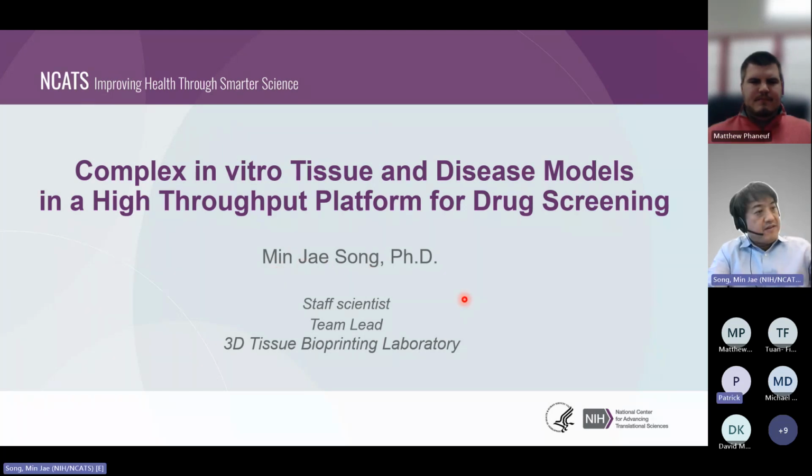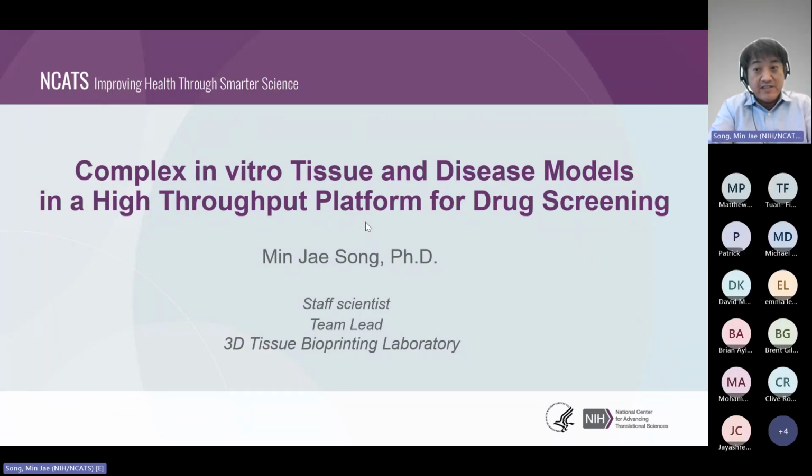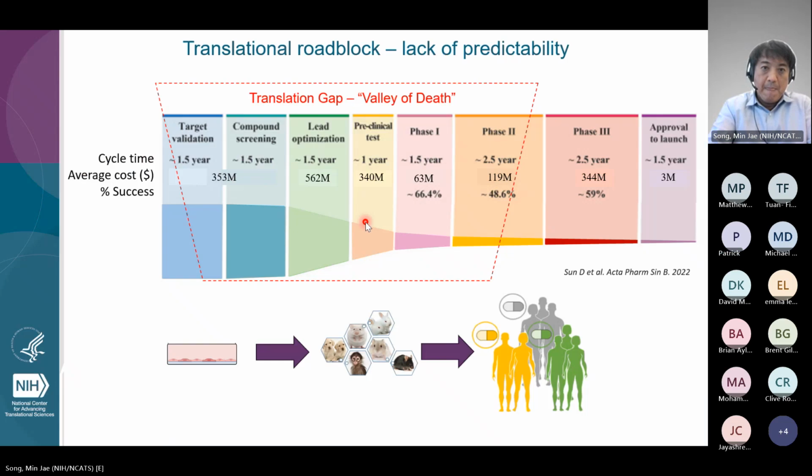Yep. Okay. So thank you very much for the introduction, Cameron, and thank you very much for organizing this webinar. And I'm really happy to present the works that we have been doing at NCATS Tissue Bioprinting Lab. My presentation will include complex in vitro models to model tissues and diseases in high throughput platforms for drug screening, and also a brief introduction of this NCATS 3D Tissue Bioprinting Lab.